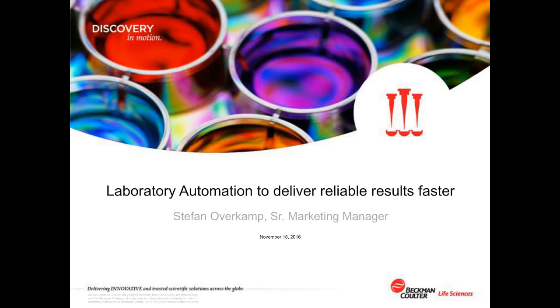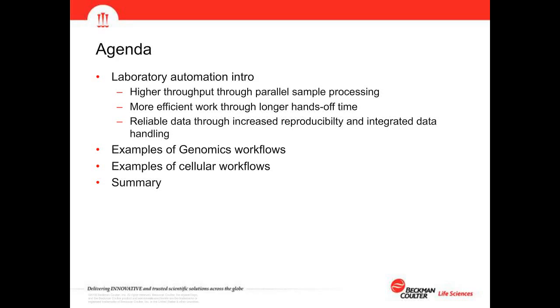Yes, thank you, Christina, and welcome everyone. I'd like to thank LabRoots for giving me the opportunity to speak here about laboratory automation and how that enables us to deliver reliable results faster. If we look at the agenda, I want to start with a brief introduction on laboratory automation, how we achieve higher throughput through parallel processing, how we achieve more efficiency through longer hands-off time, and how we deliver reliable data through increased reproducibility and integrated data handling.